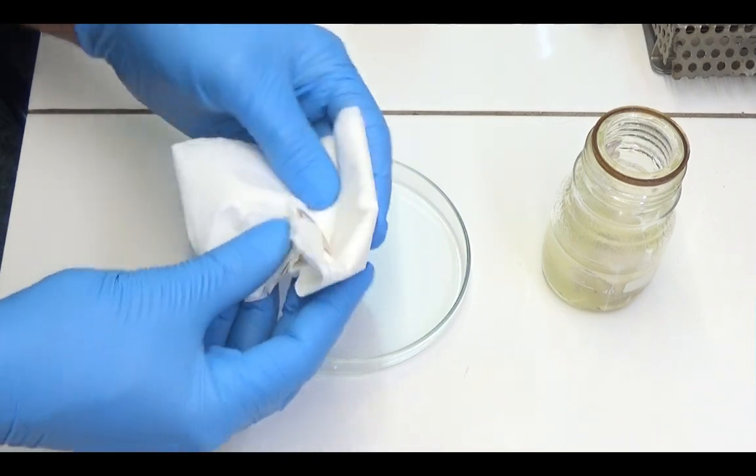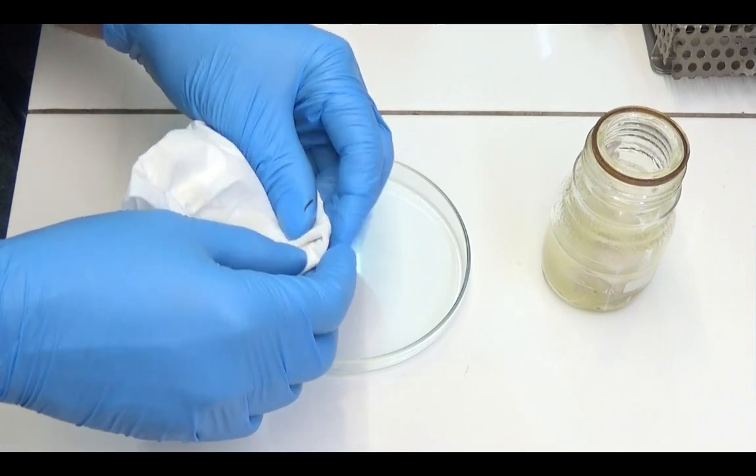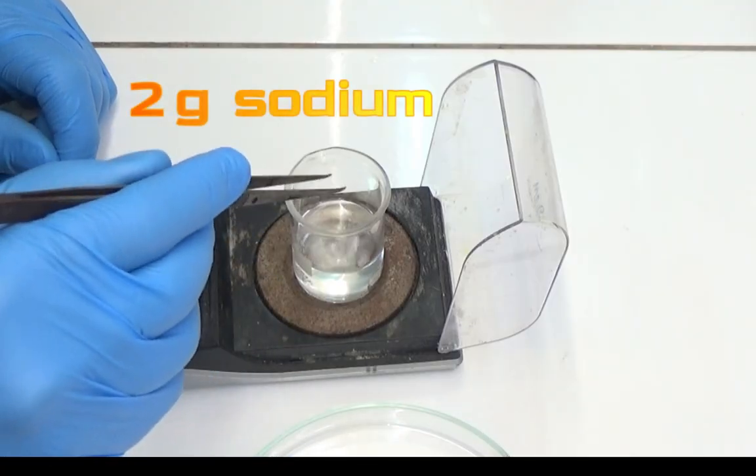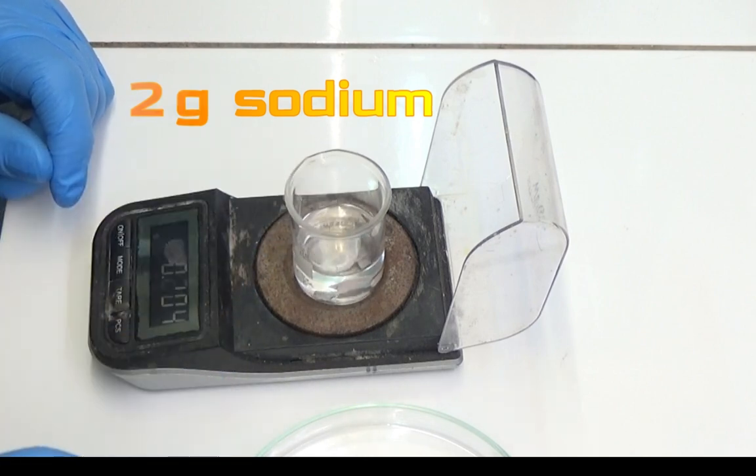Sodium is stored in liquid Vaseline, so to use it, we dry it well with blotting paper and cut it into small pieces. We weigh 2 grams in a beaker with hexane. The hexane cleans the remains of Vaseline and does not react with sodium.